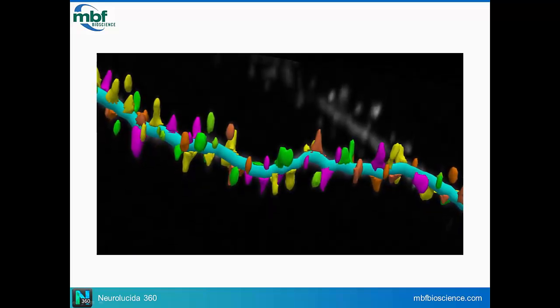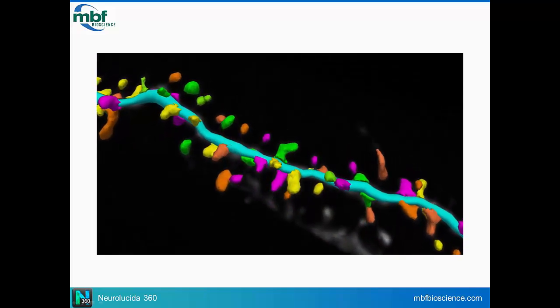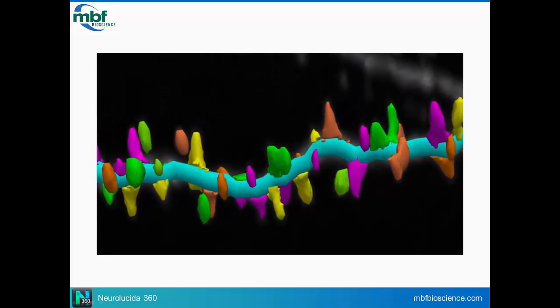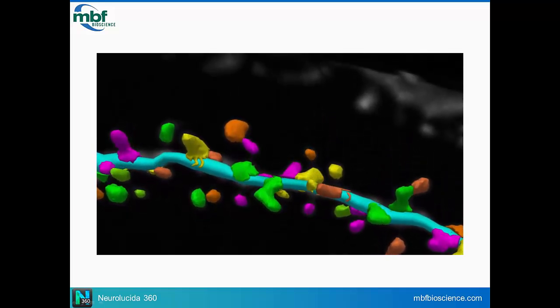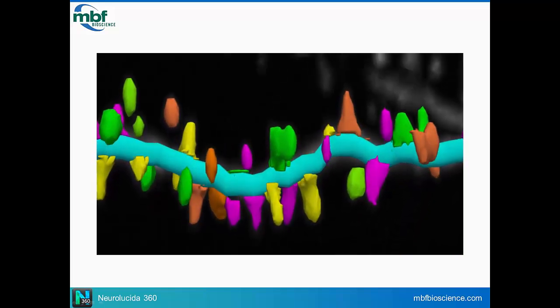Yes, so we get them from EMS or Fisher. I can send him the information. I can get the catalog number for him, and I can get that later. I don't have it off the top of my head. Okay, we'll post that on the website because we're going to answer these questions, so we'll provide that information there after the webinar. That sounds great.